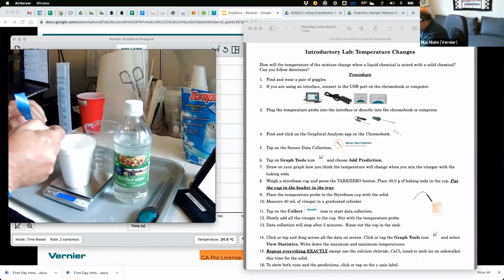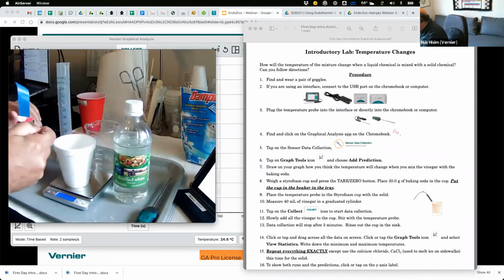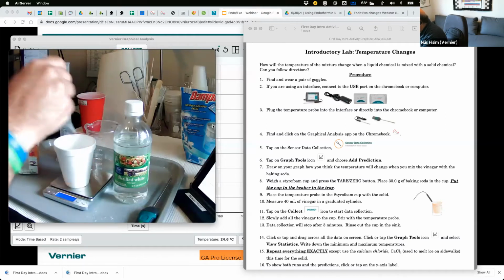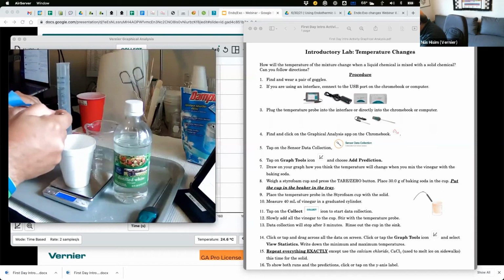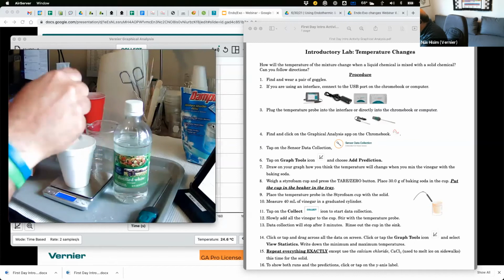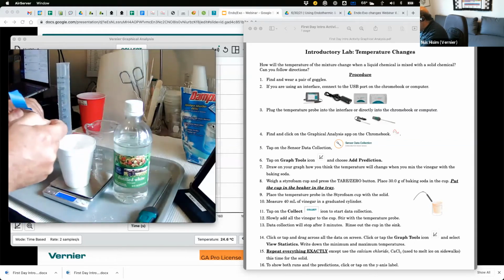They go back to their station. Some were real excited, some were less than excited, but the whole idea is at least they're doing something. They're not waiting for the teacher to hand out textbooks and write the number down and fill out that info card or whatever method that's used at the first day of school. They're using a scoopula, and they might not.